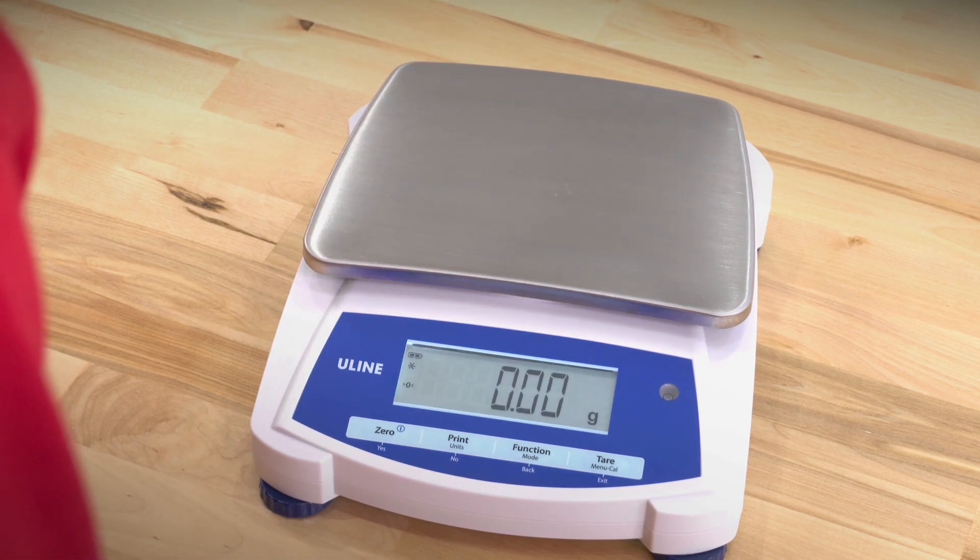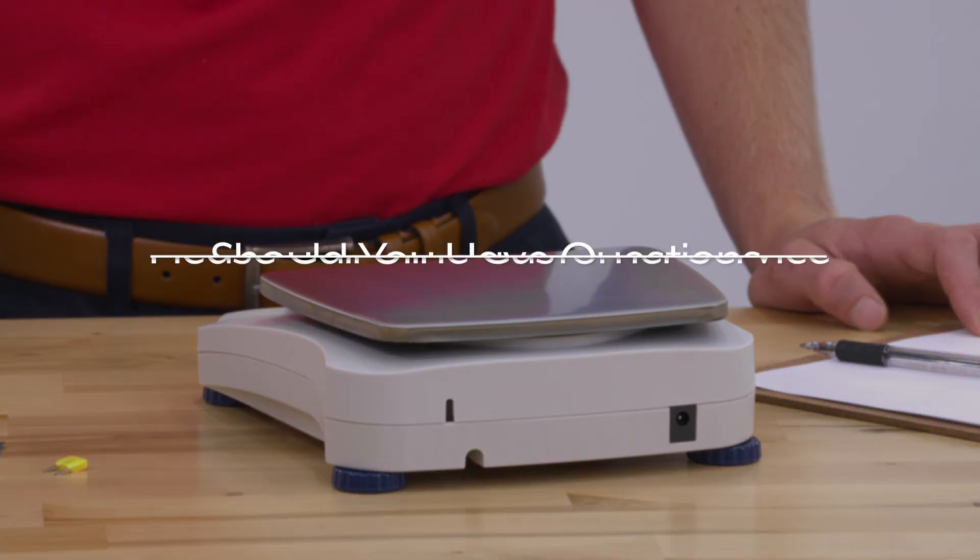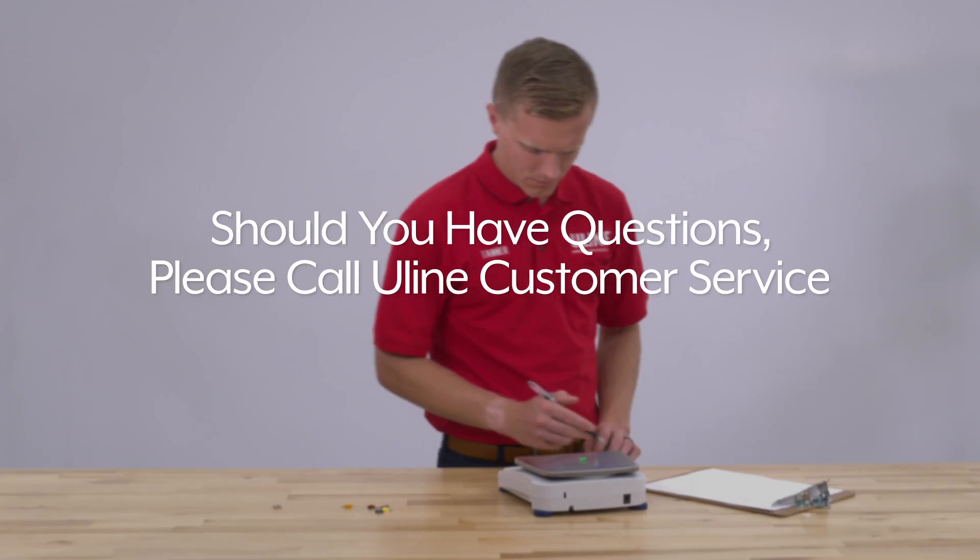The scale will return to the previous application mode and is ready for use. Should you have questions, please call Uline Customer Service.